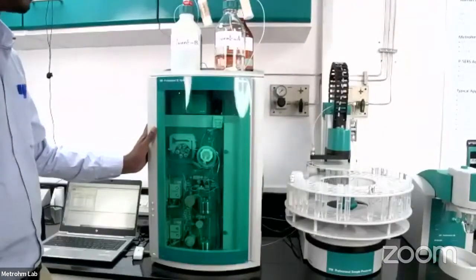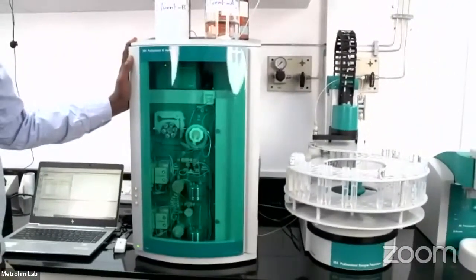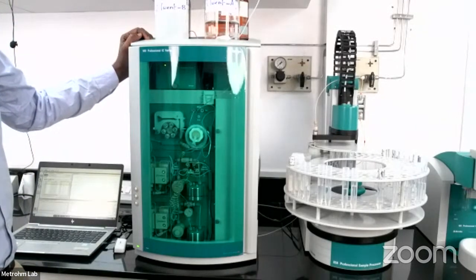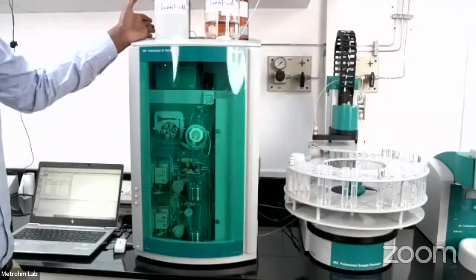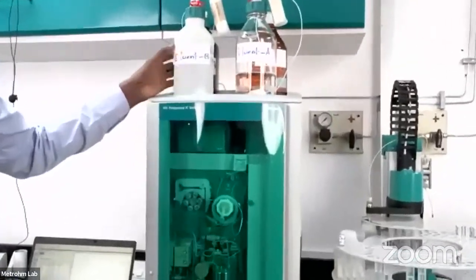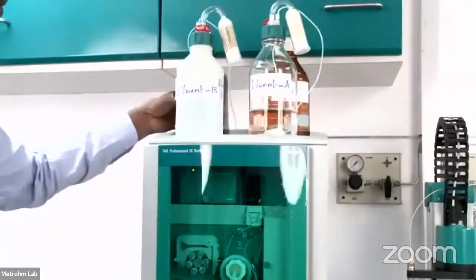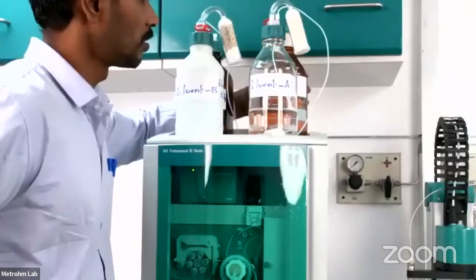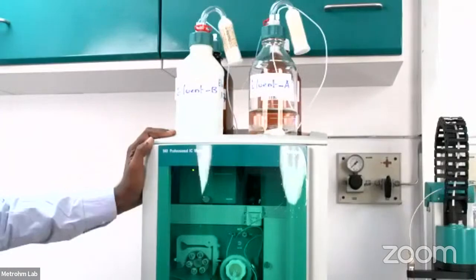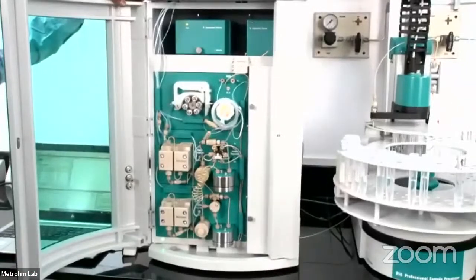So now we can see our instrument 940, the Professional IC Vario. And you can see this is the eluent organizer, so we can say it is the mobile phase. We can keep almost 4 eluent bottles on top of the instrument. And this is the reagent bottles for the suppressor reagent and rinsing of our suppressor solutions. This is ultrapure water for suppressor treatment. And if you open the instrument, this is what an ion chromatograph looks like.